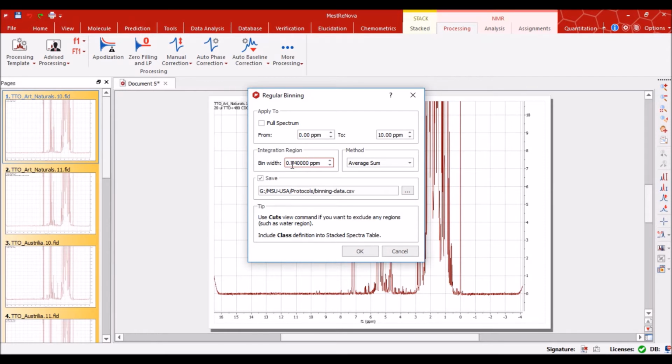So what is this? It is actually the area under the curve. There is a curve of this peak, or there is a curve of any single peak, so a bin is the division of that. So we can calculate, or transpose or transfer, the spectra from a graphical representation to a numerical representation.